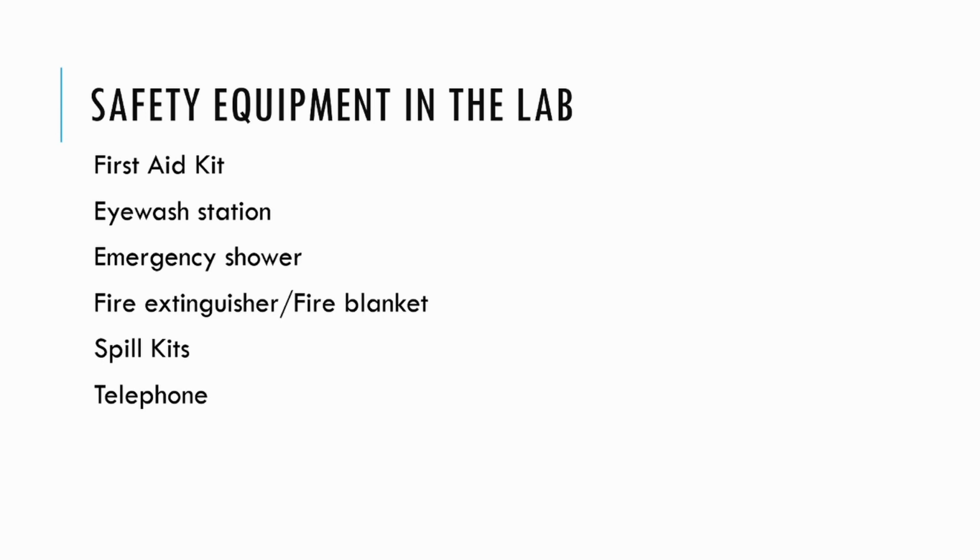Accidents are generally rare, and I don't expect any of you to ever have to use any of this equipment. But even though it's a very rare thing to happen, you still want to be aware of where these items are in the labs that you are in.